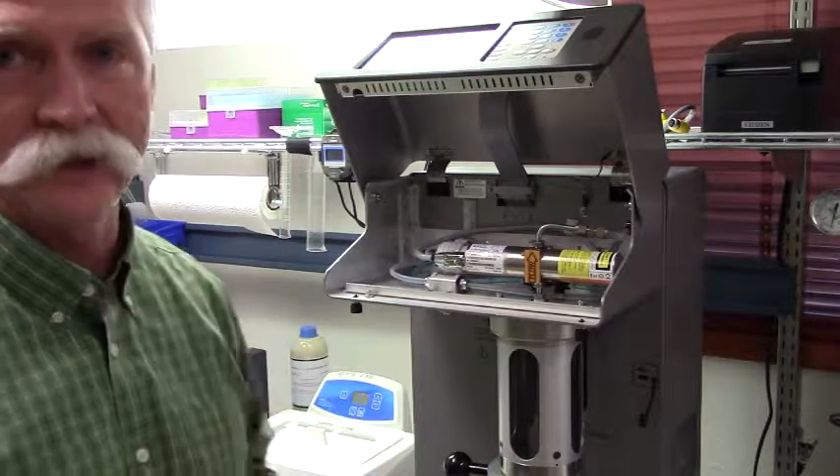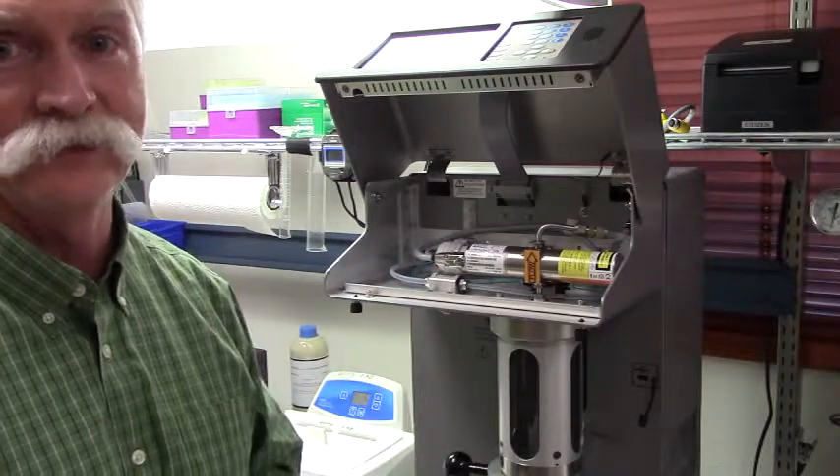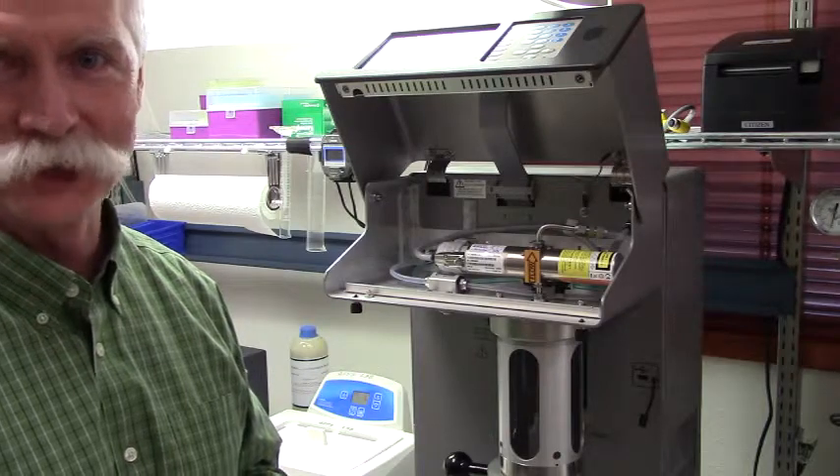Your instrument is now ready to be turned on. That concludes the setup of an 8011 system from the box to the bench. I'm Bill Bars. Good day.